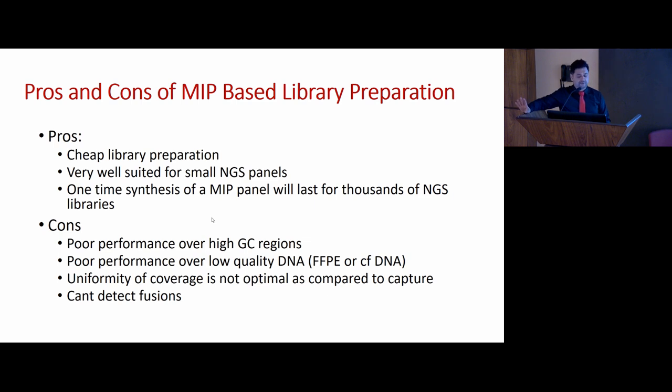Cons, it's still not perfect. It doesn't do well with GC-rich regions. CEBPA, forget about it. Poor performance over low quality DNA, forget about it working on FFPE, cell-free DNA, and so on. Uniformity of coverage is not great as compared to capture and can't detect fusions.